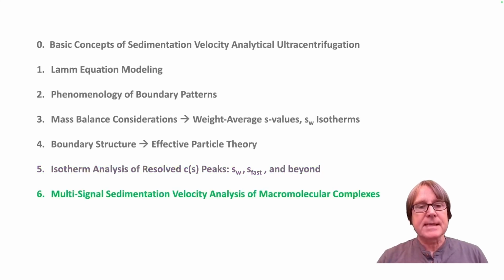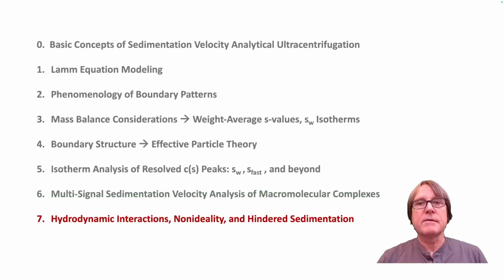We will then discuss an independent approach for studying multi-component macromolecular complexes through a multi-signal extension of our sedimentation coefficient distribution analysis. And finally, we'll talk about how hydrodynamic interactions impact the sedimentation process and how we can take that into account.